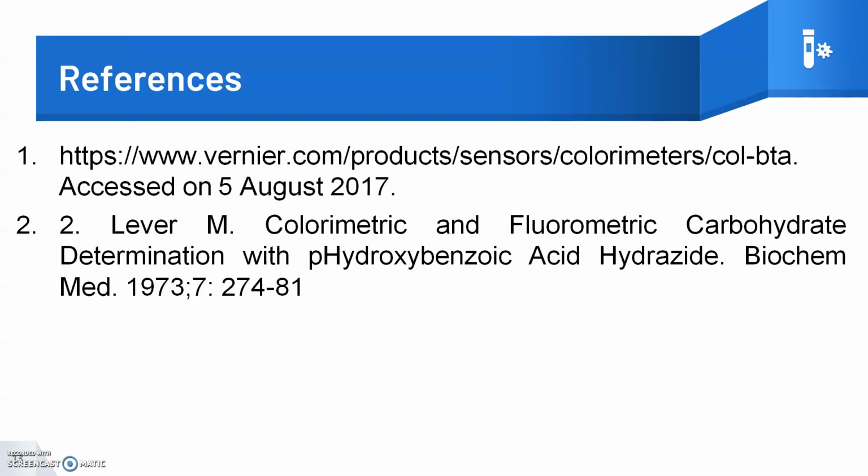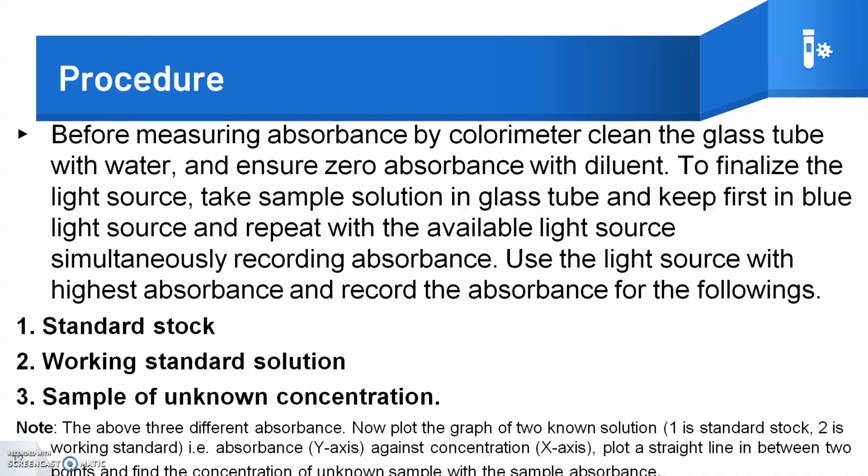So these are the references. By this you can easily find out the unknown concentration of whatever dextrose sample, glucose sample or sucrose sample.